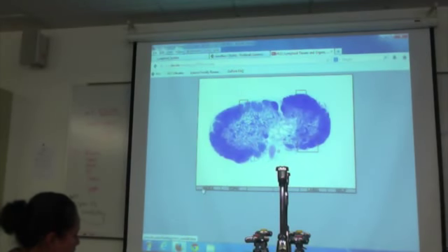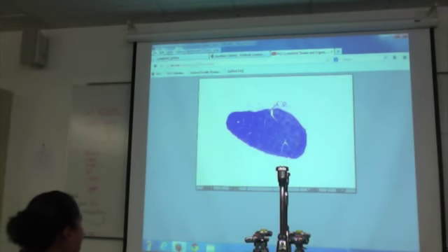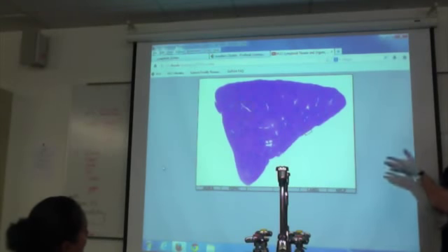So you have to get really good on your slides. Make sure you look at the whole picture first before you zoom in. Otherwise it'll just look like red and dark. That's a node. Let's go back to spleen land. Here's a very beautiful spleen. Notice the red and the white. Notice also that the circles are interspersed everywhere. There's no inside-outside medulla. Beautiful, beautiful spleen.